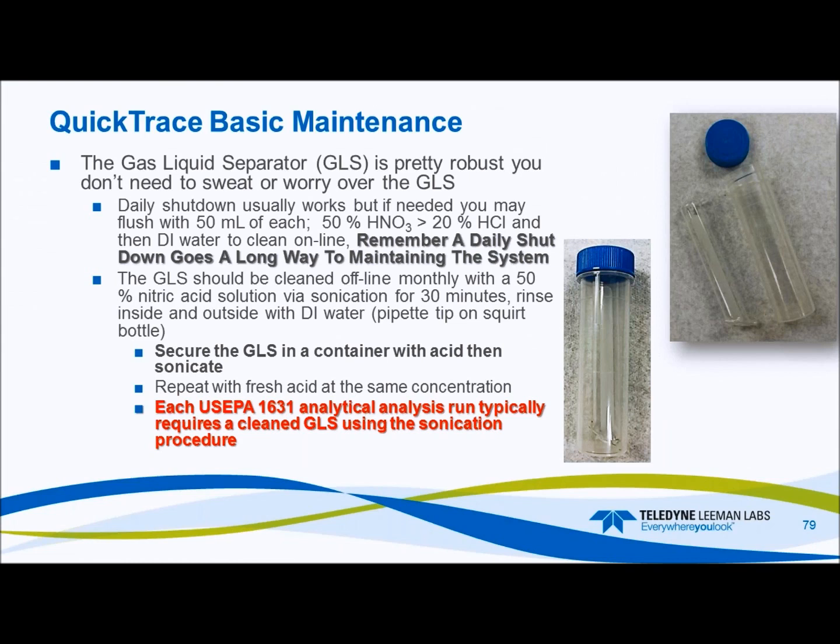So other metal departments like the ICP-MS, I'm not picking on those people, but ICP-OES and so forth, they should not use anything that's deemed mercury. So if you label it, keep it in control, keep it with your method for mercury analysis, and it'll produce a lot less headaches.